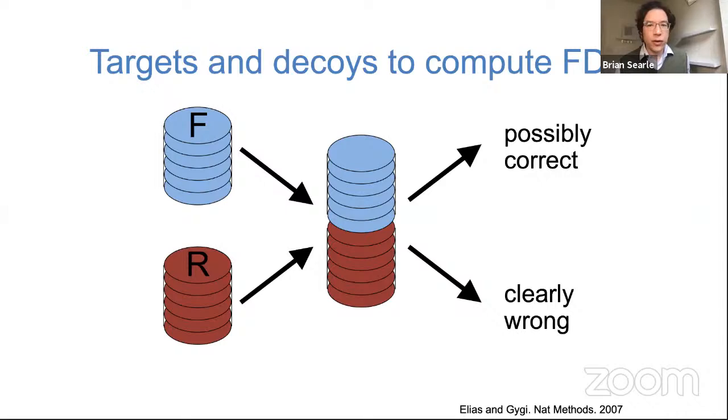So that gives you a way to say, what do bad peptides look like? What are the scores for bad peptides? And how much better are the scores for the forward peptides than these reverse peptides, as a way to judge how confident you are in that type of measurement.